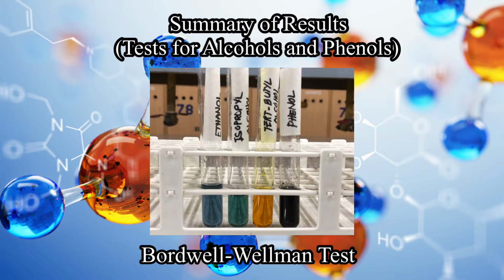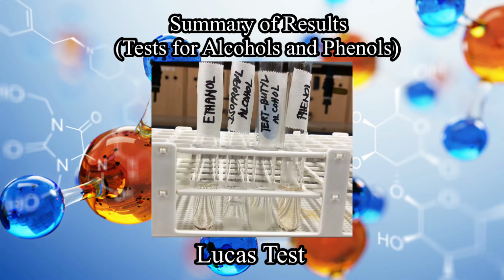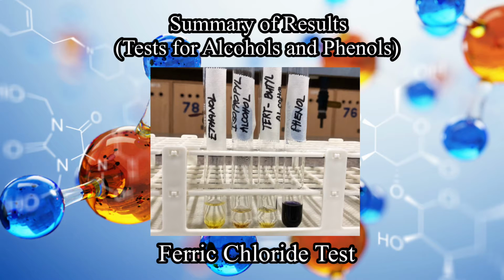As a summary, here are the results of the different tests. This one is for the Bordwell-Wellman test. Next is the result of the Lucas test after standing for 5 minutes. And lastly, the ferric chloride test for the phenolic groups.